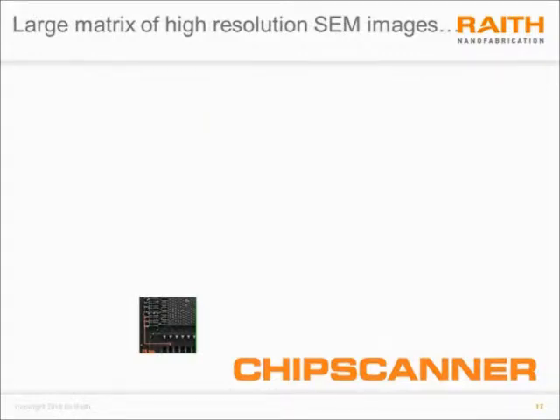Let's have a look at how the chip scanner captures a large matrix of high resolution images. So here we have a 50 micron field of view with all the corrections, and all of these corrections are applied in real time as the image is captured. These corrections are stored in the scanning electronics hardware, and so whenever we scan an image, all of those corrections are being applied in real time.